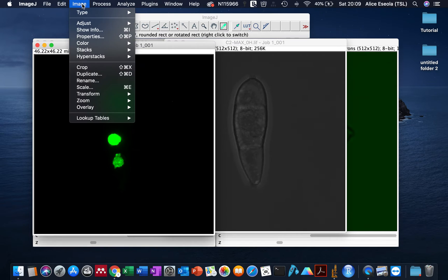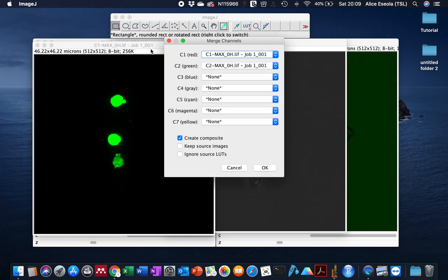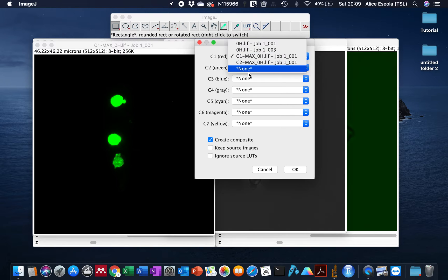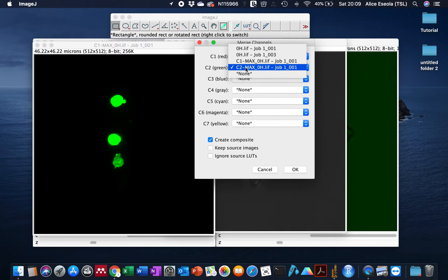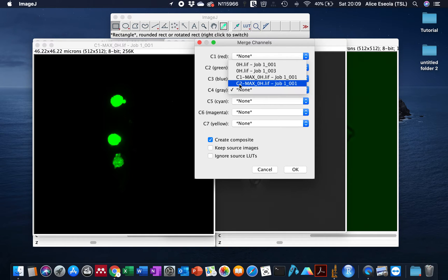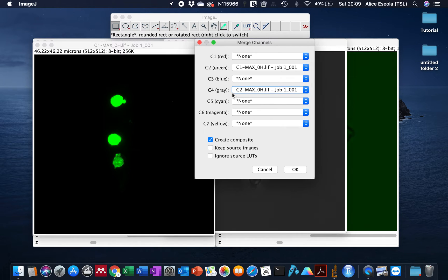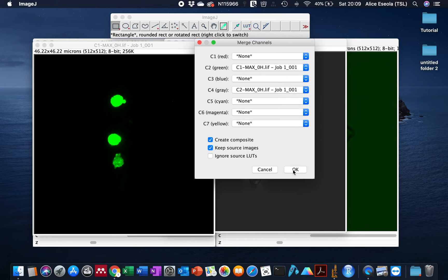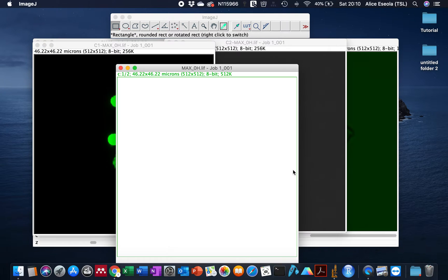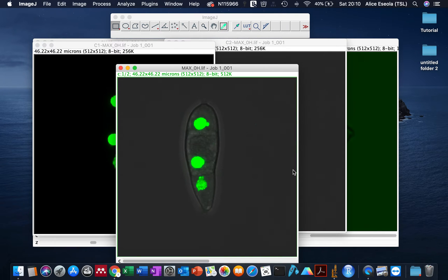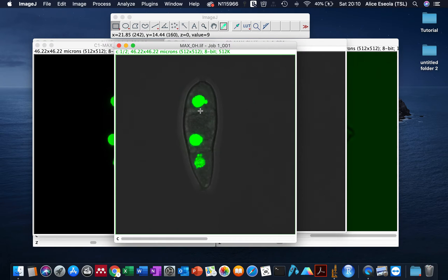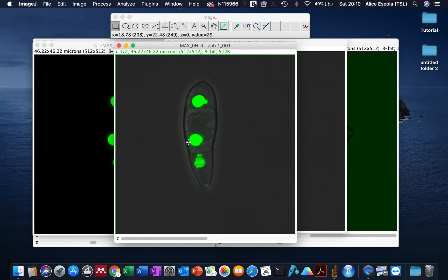Remember that our green channel is the first channel. We don't have a red channel, so our green channel is the first channel and our gray panel, which is the bright field image, is the second channel. It's important to click on Keep Source Image, otherwise it will merge the channels and close the different channels. With this we're able to have a single image that contains both channels without the green channel color affecting the bright field.